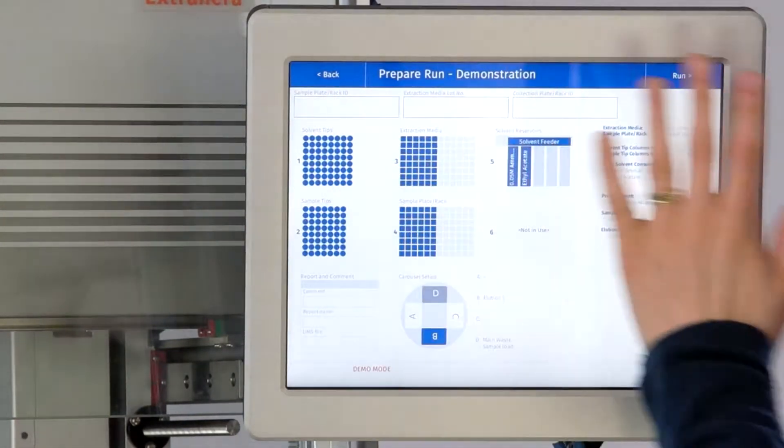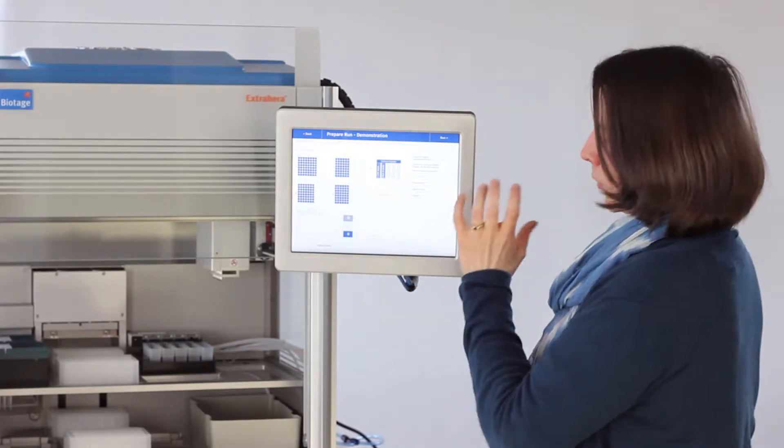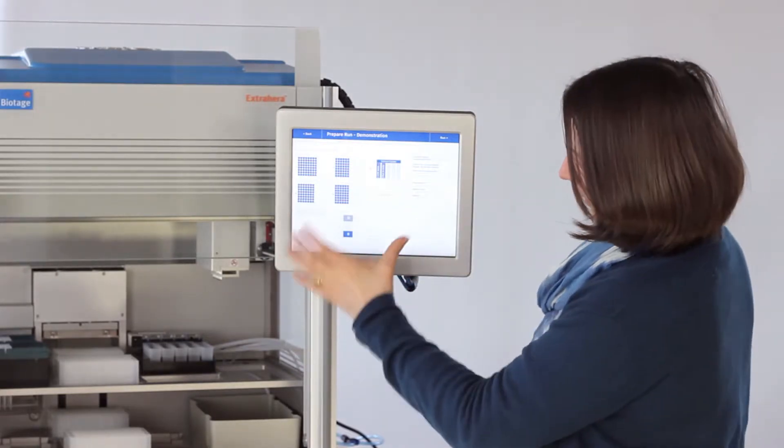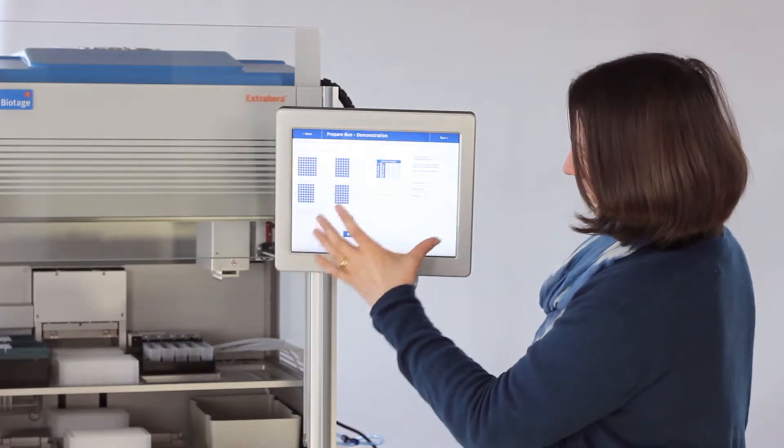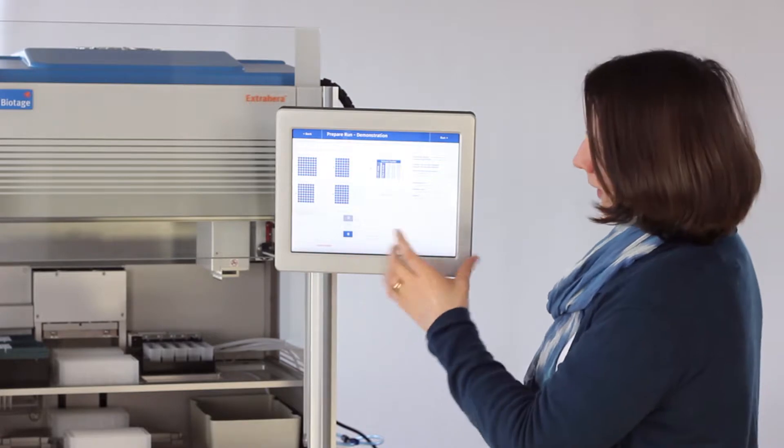As long as there are no red marks and no orange highlights on this plate, then we're okay to run.